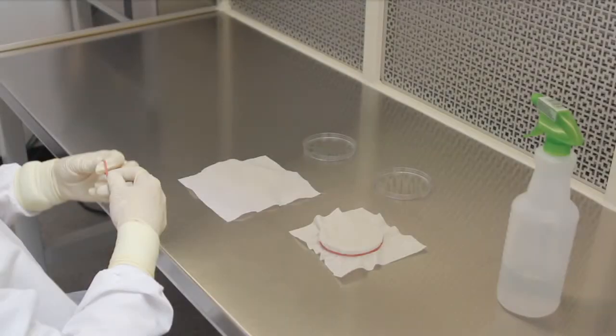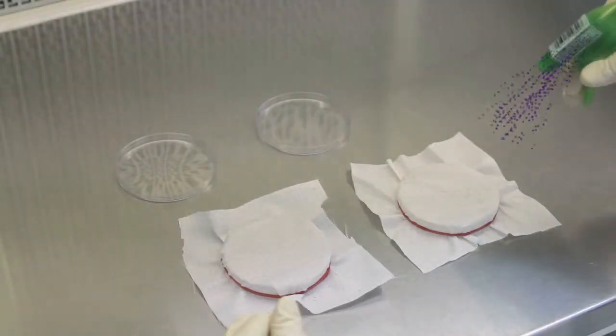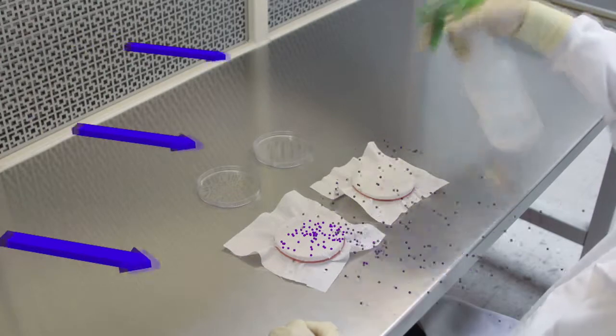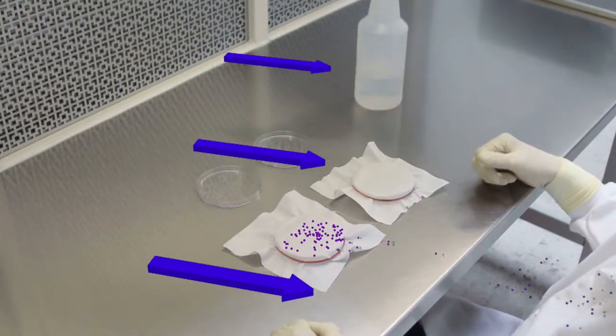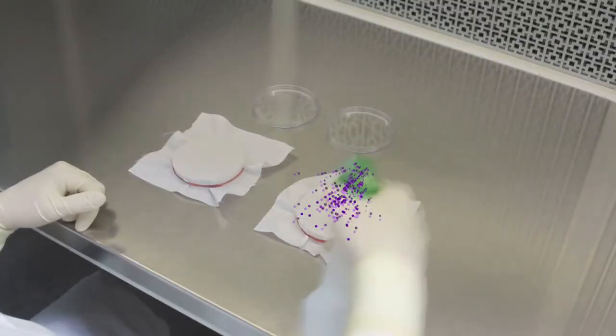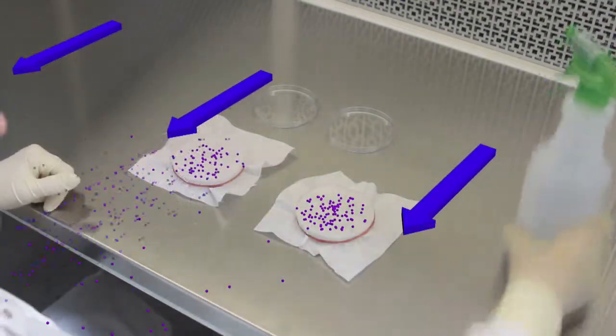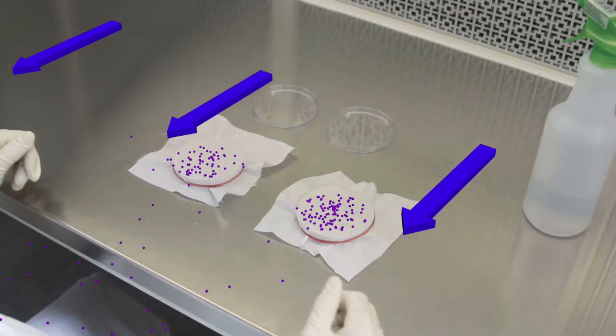First, the test is being performed in a horizontal laminar flow hood. If the hood is operating, the bacteria sprayed onto the fabric will be blown out of the hood and into the unprotected face of the technician. Much of the bacteria will blow away before even landing on the fabric. This would reduce the bacterial challenge to the fabric and artificially increase the BFE.